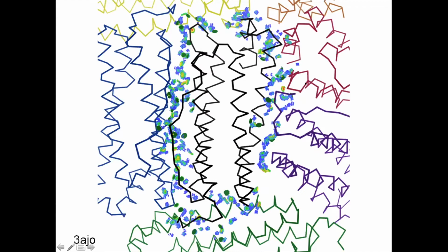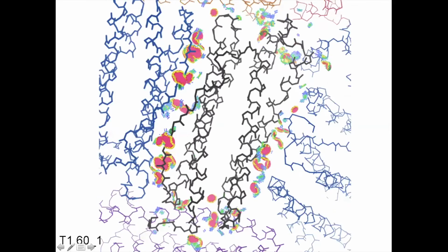And a couple of the models look like this, where they obviously hadn't been looking at the neighbor when they were fitting the unique unit. And you can do that for a little while, although I think it's still better to turn on the neighbors even from the beginning, because it's not trivial to fix these large clashes between the neighbors.